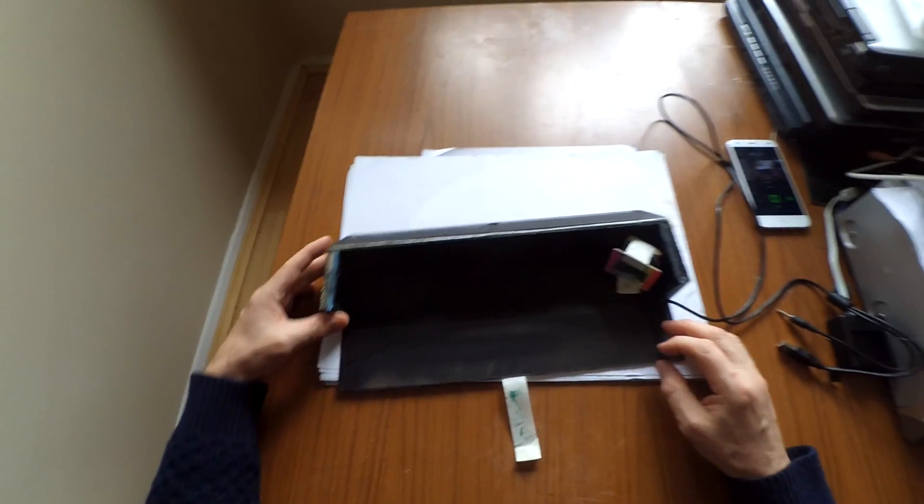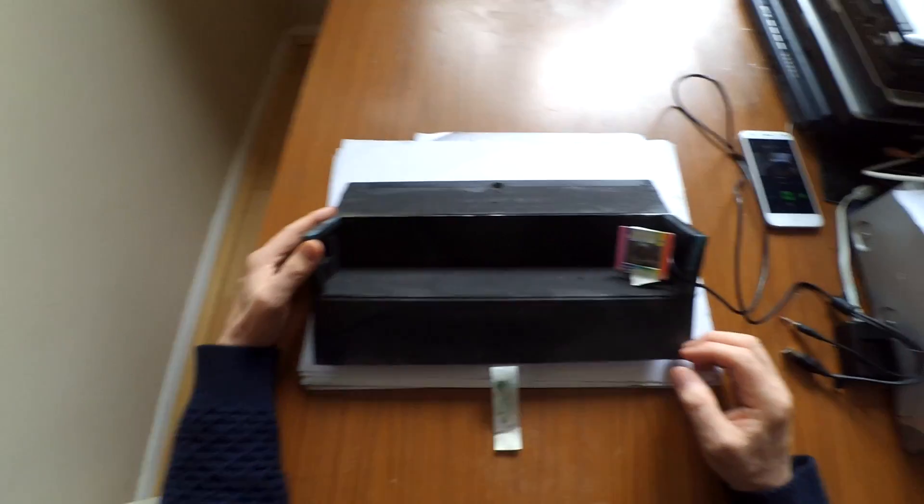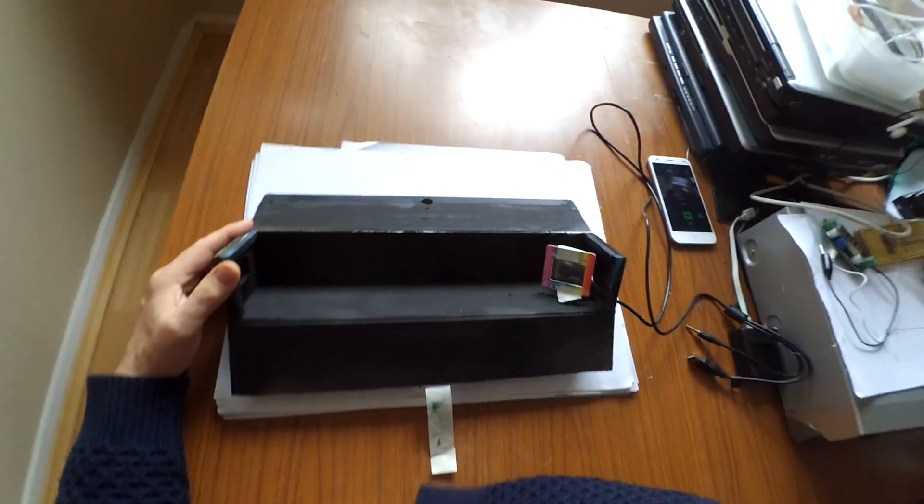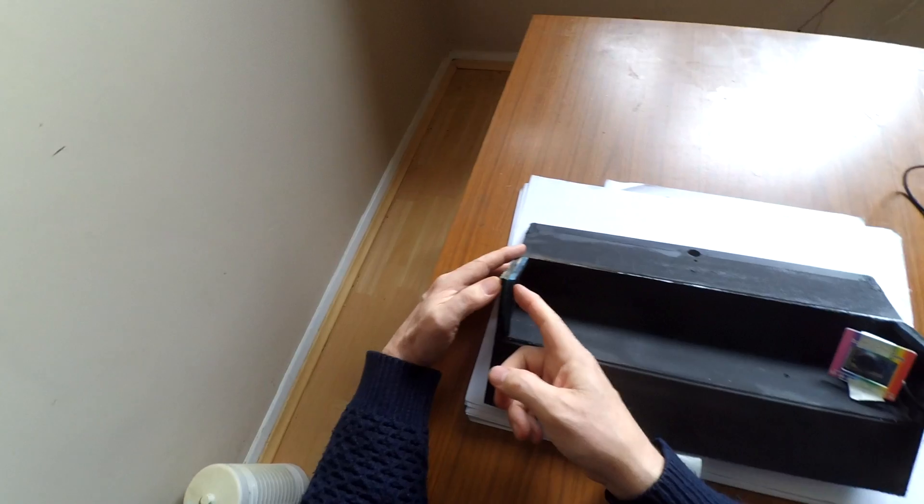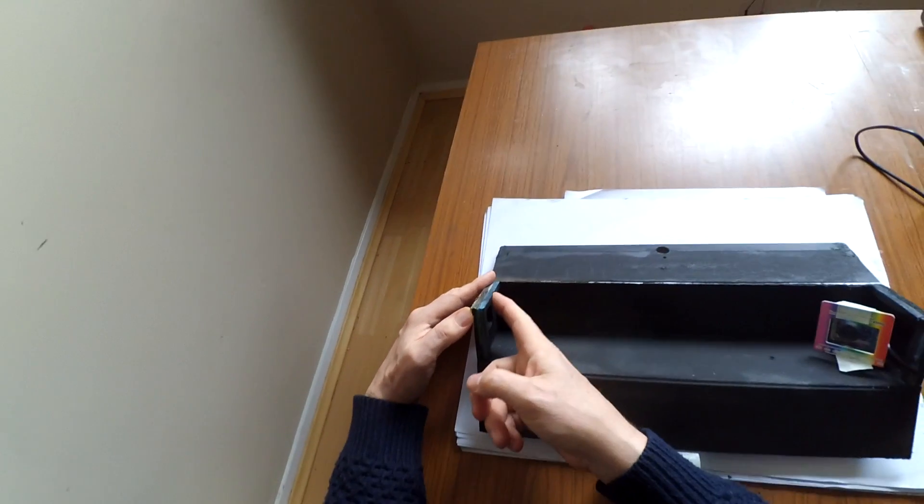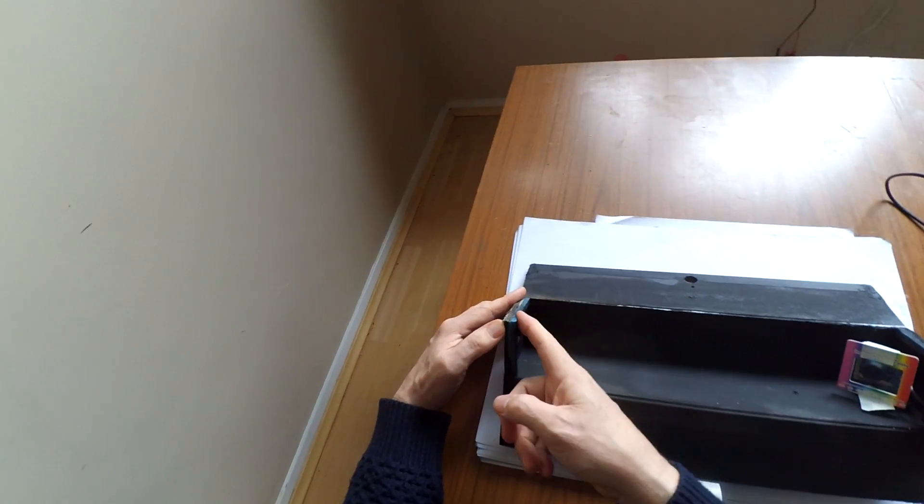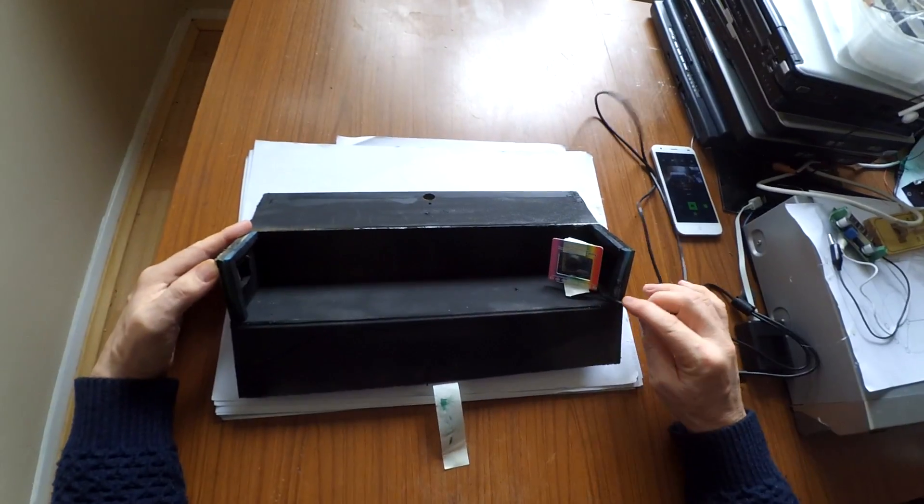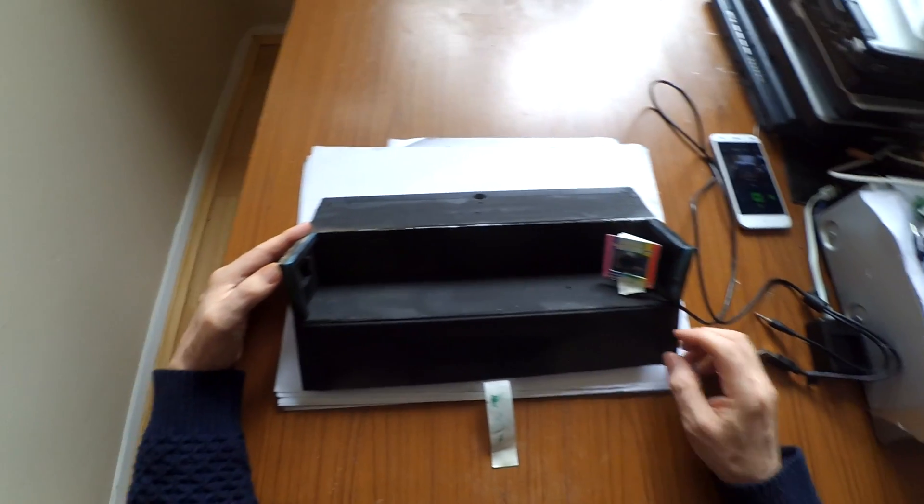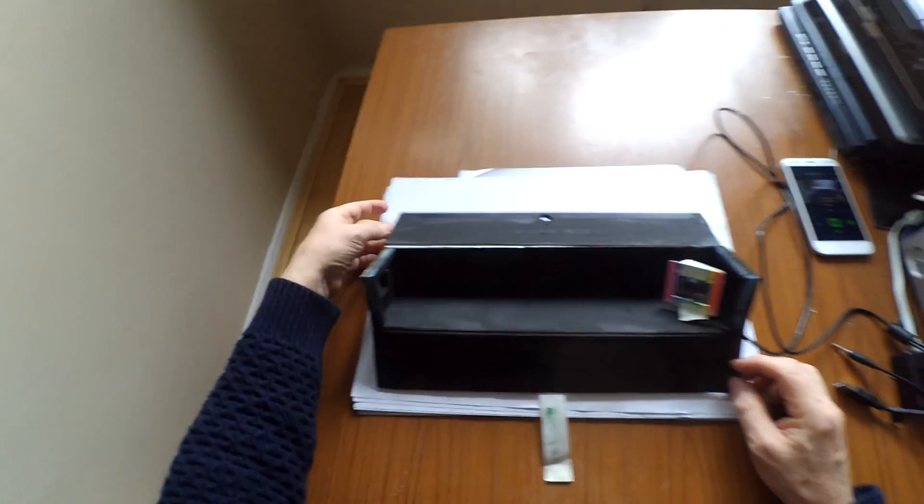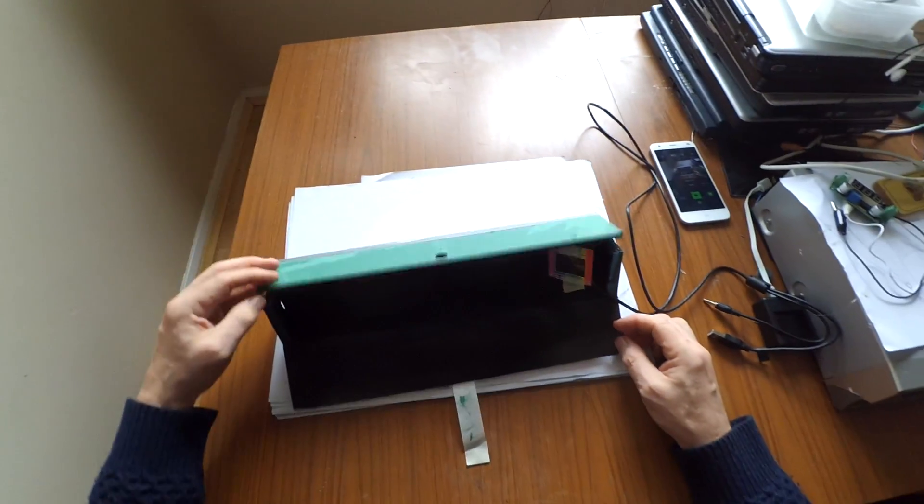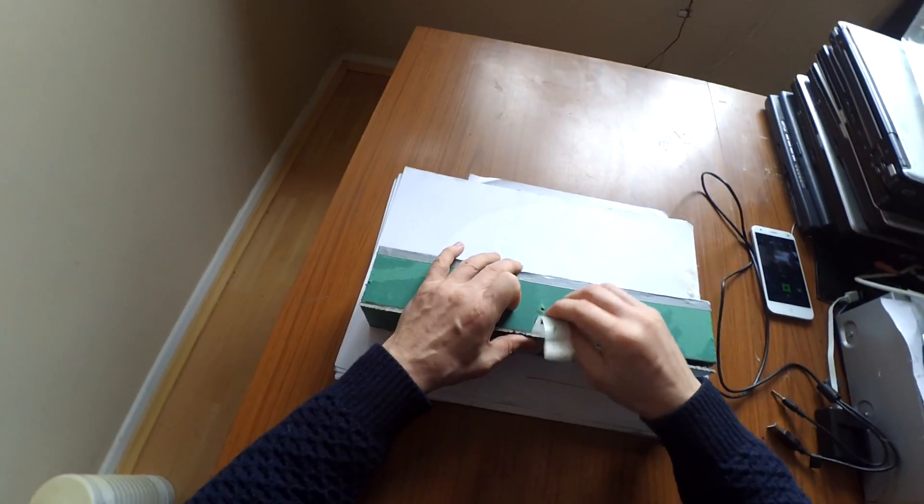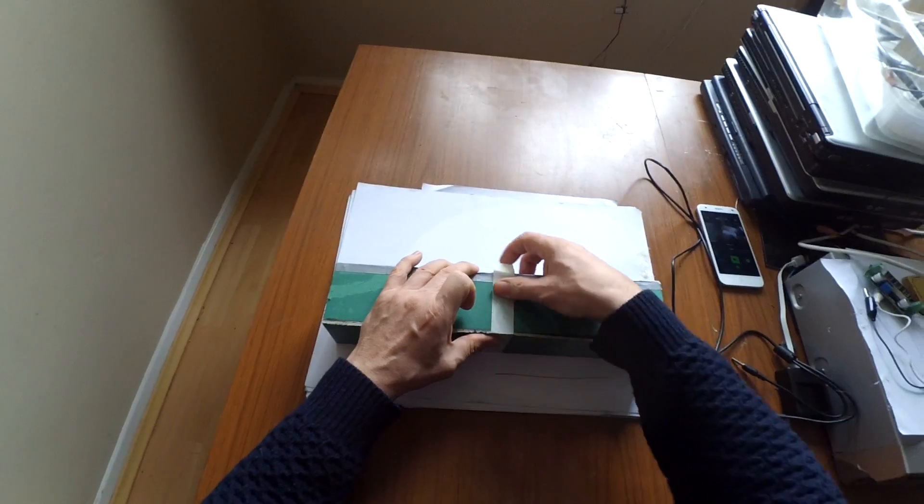Sprayed black to minimize stray light inside. There's some foam gaskets at each end which allow the thing to shut and be reasonably light tight.